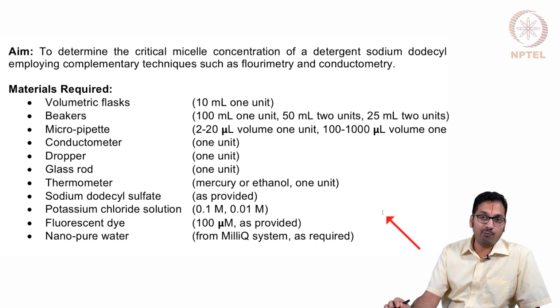Think about taking tap water. If it's too hard, there could be other salts that could change your conductometric measurements and would result in systematic error there.